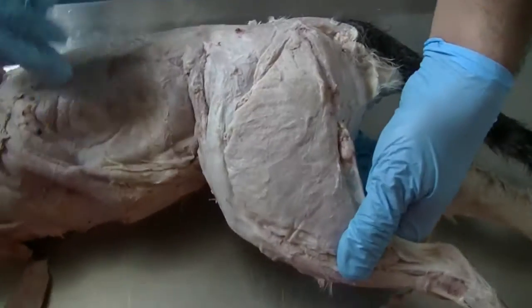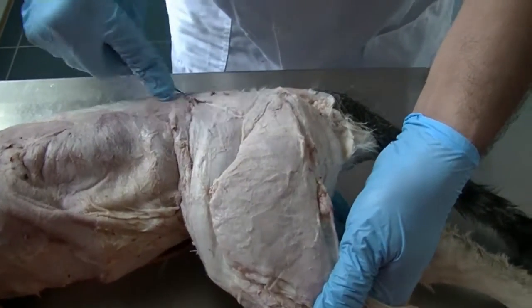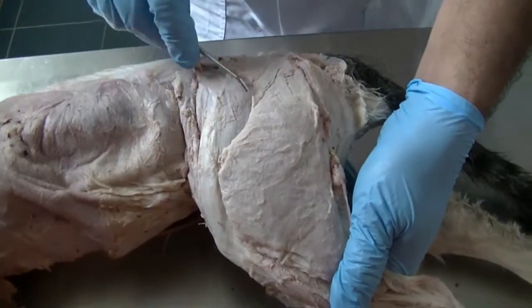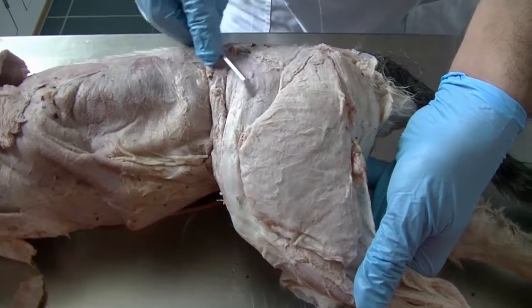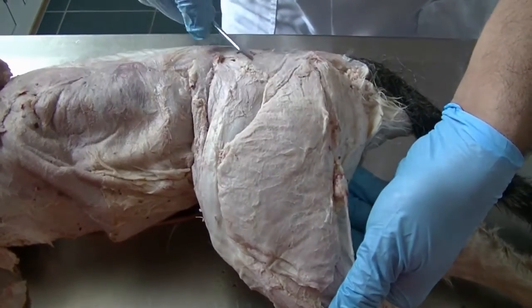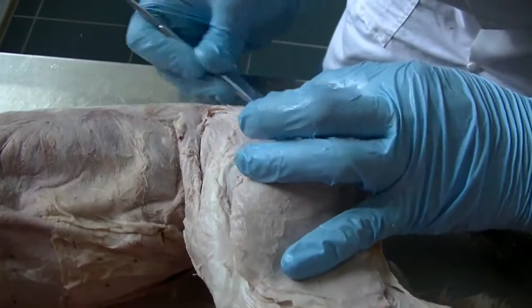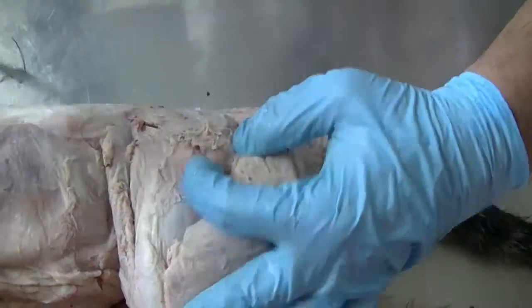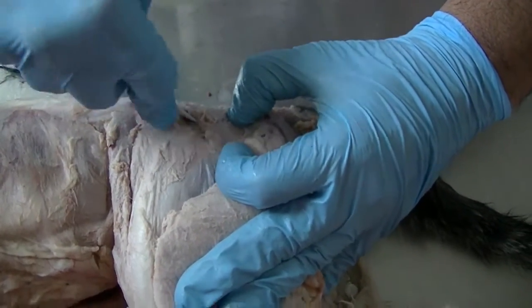Okay, so what we see here again, the gluteal muscles separating the middle gluteal from the tensor fascia lata, the triangular muscle here which continues further into the fascia lata, that is the tensor fascia lata, the cranial crural abductor. After reflecting the cranial crural abductor, I'm going to separate the superficial gluteal to expose the middle gluteal completely.